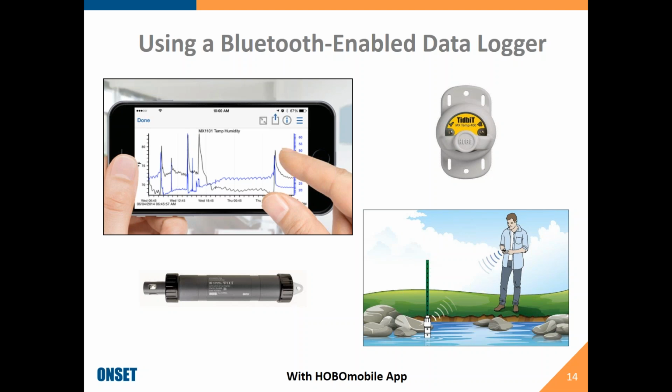As you can see in the illustration below, the communication part of this logger is secured above the waterline to allow for communication with a mobile device within 100 feet line of sight. Now, this is a mounting technique you can take into consideration if the application permits it. But one thing I'd like you to take into consideration is that the sensor must stay submerged the whole time.